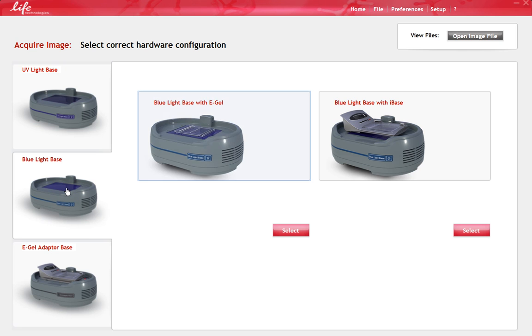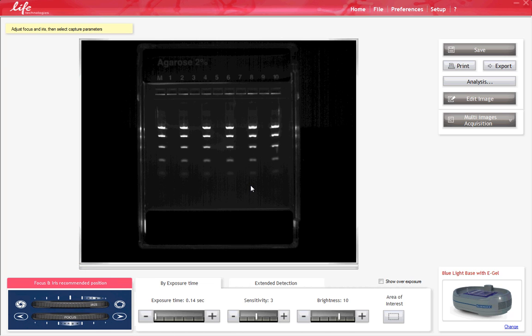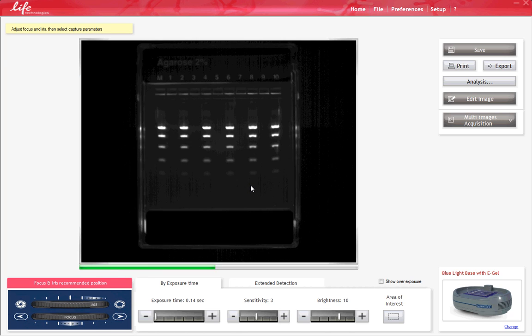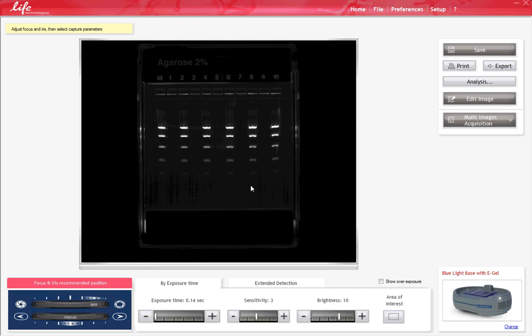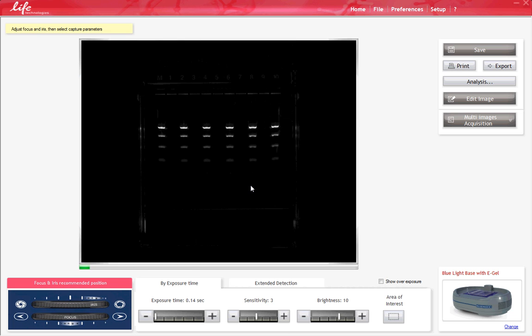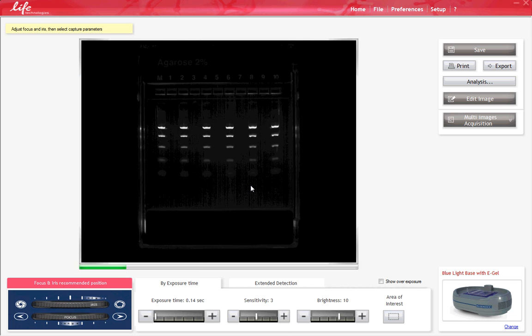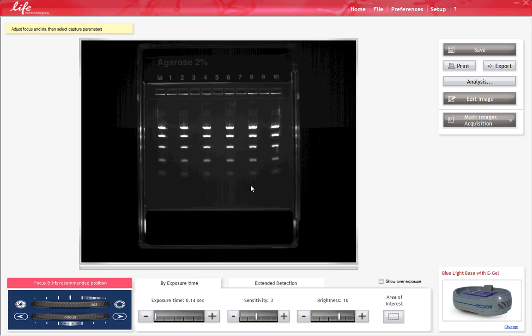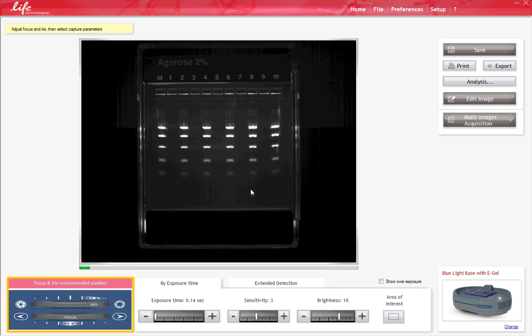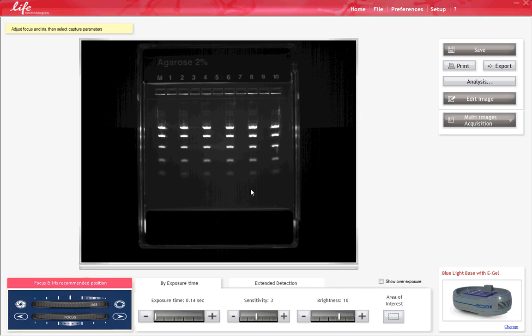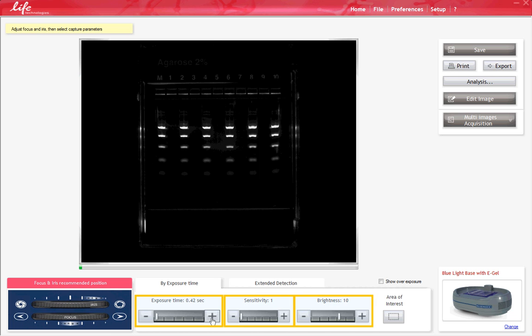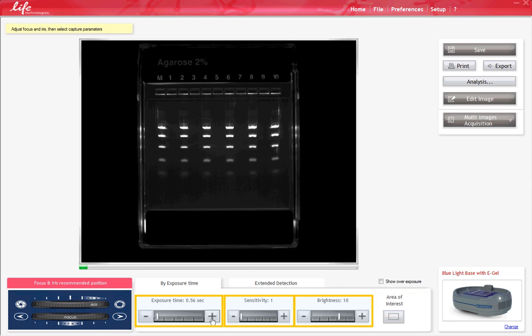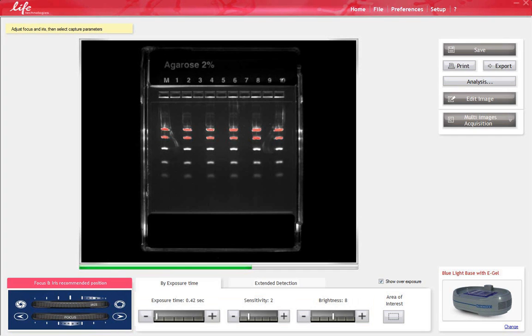To obtain the desired image, first verify that the manual focus and iris dials on the camera hood are adjusted to the recommended settings for the type of eGel Imager Base being used. The recommended settings are shown in the lower left-hand corner of the software window. You can increase the signal intensity by adjusting the exposure time, sensitivity, and brightness. Use the overexposure feature to visualize overexposed bands shown in red.